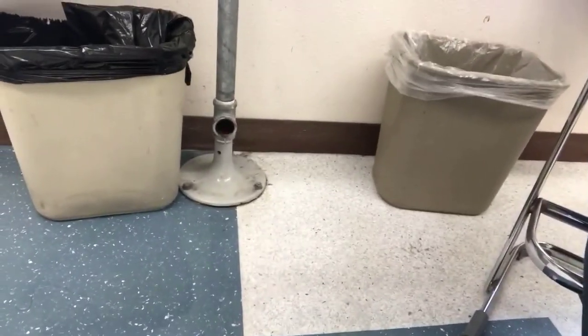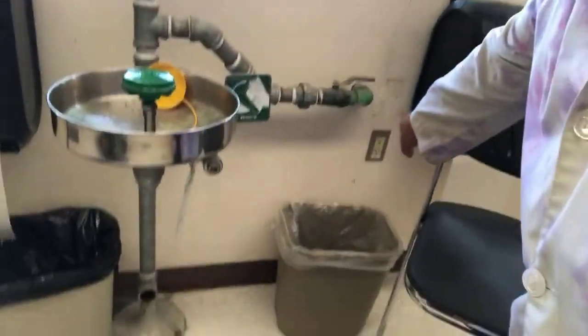because of the way this has been set up, and it won't be this way in the new labs, there's not really a drain for the water, so it just comes out on the floor. It can get really slippery, okay? And ignore the electrical outlet that's over here. Anyways, it's not well designed.